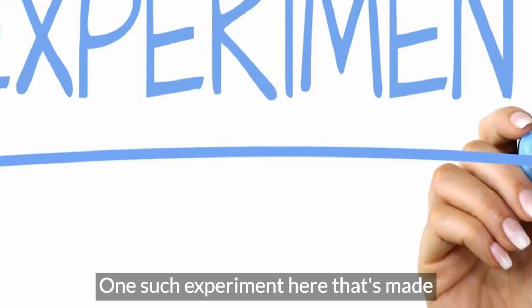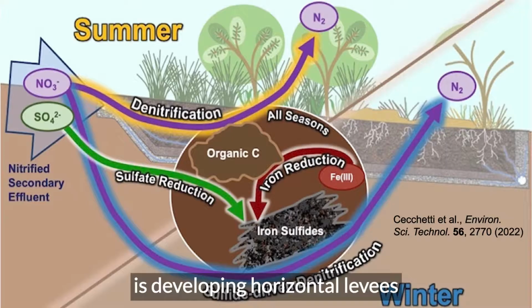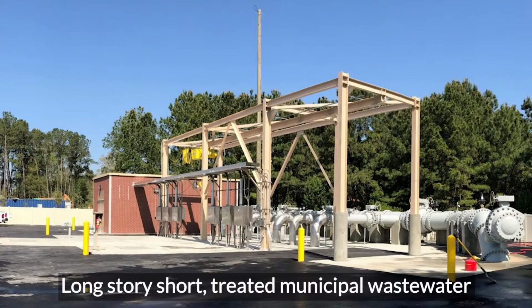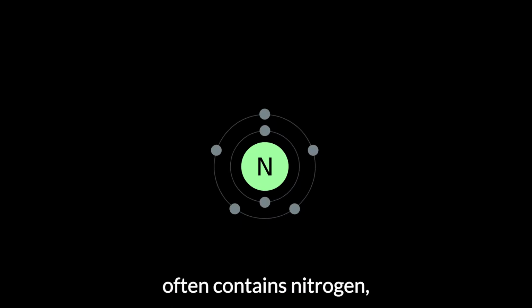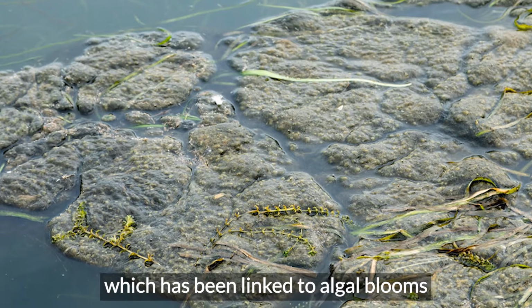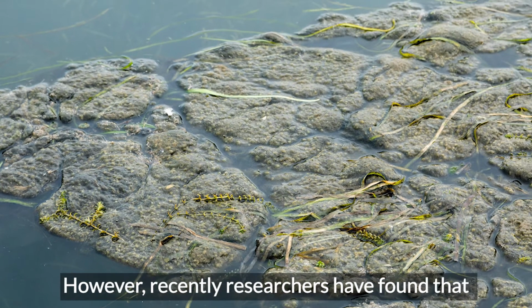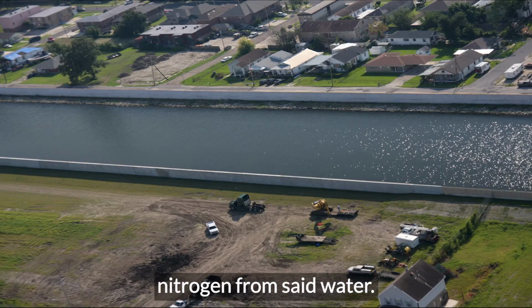One such experiment here that's made use of X-ray absorption spectroscopy is developing horizontal levees to remove nitrogen from wastewater. Long story short, treated municipal wastewater often contains nitrogen, which has been linked to algal blooms that can devastate coastal ecosystems. However, recently researchers have found that horizontal levees can help to remove nitrogen from said water.